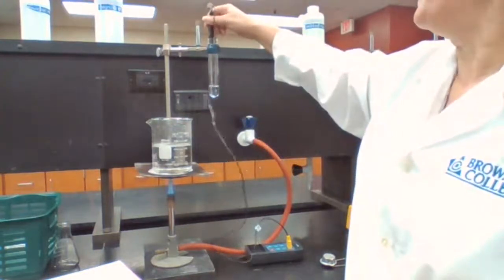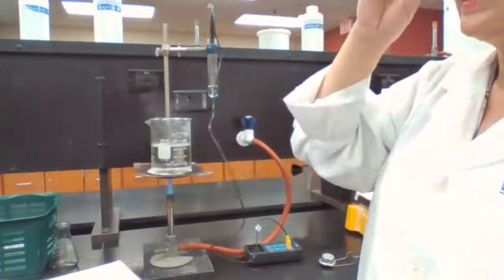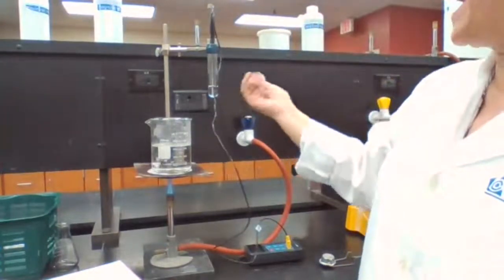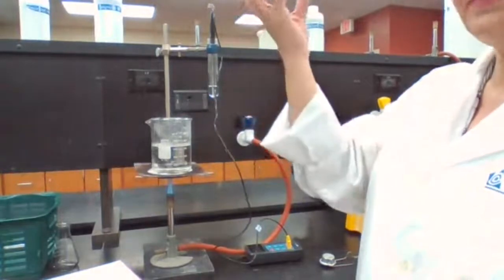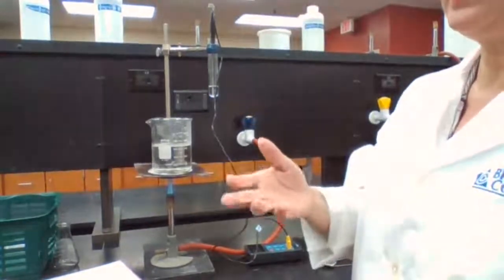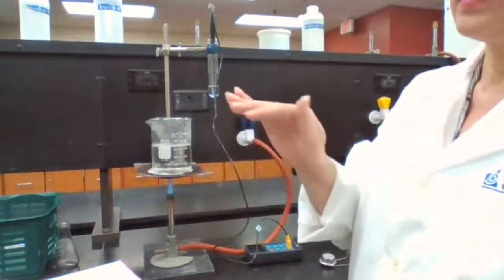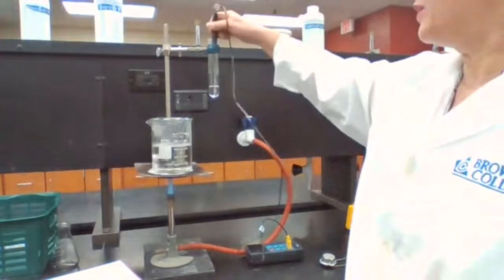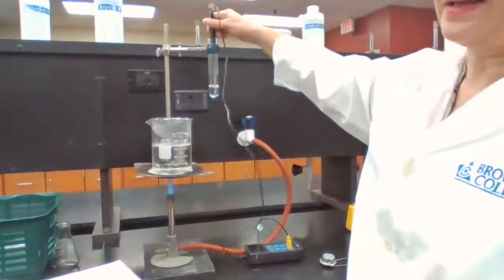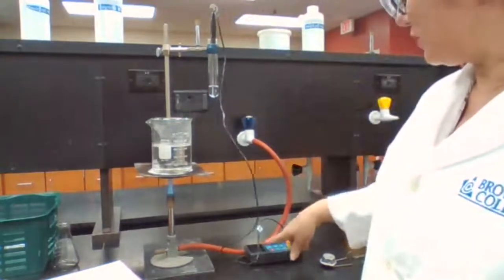There is a term when you read the experiment or the procedure, it's called supercooling. That happens often with benzophenone. Before it freezes, it gets even colder than the freezing point. Then the temperature rises back up. So we have to look for the temperature that stays. It goes down and it comes up again. That will tell you the temperature, what is happening.